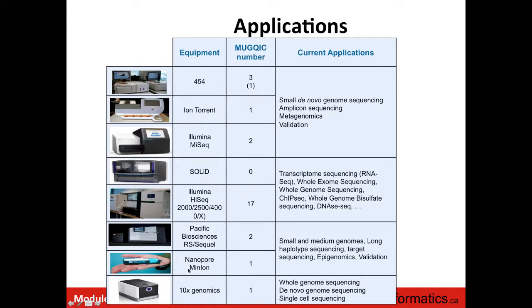And then you have the long read technologies. Here these two technologies, PacBio and Oxford Nanopore, we use mostly to do small and medium genome analysis, and it's particularly efficient for genome assembly. If you don't have any reference genome for your species, it's really good to create the reference genome. We also do some targeted sequencing if we want to characterize a full transcript of 1 or 2 KB. It's cool to have the full transcript in one molecule, so you see one read that contains all your transcript instead of multiple reads.